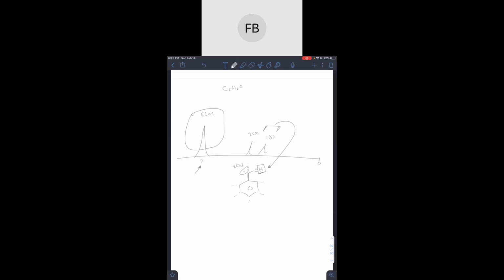Now, if you guys look very closely at your sheet, we're on page 8. That singlet does not look like a typical singlet, does it? It's a tiny little bump. So short. Do you guys see that? He circled it at the bottom of page 8.